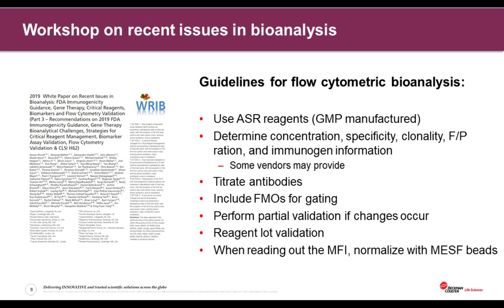Last year, the guidelines for flow cytometric bioanalysis came up with several points that I'm going to address here.